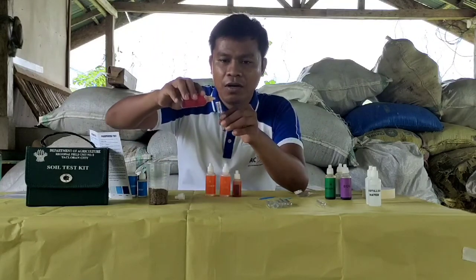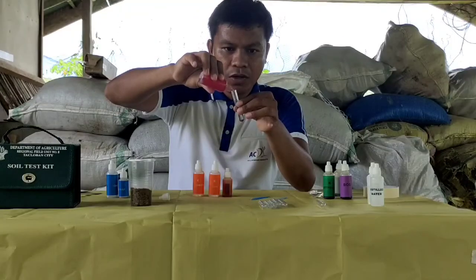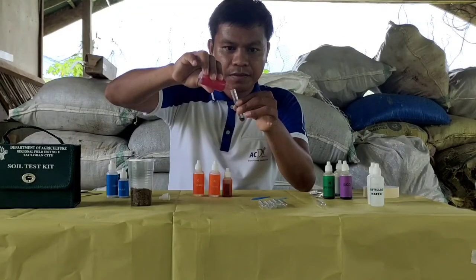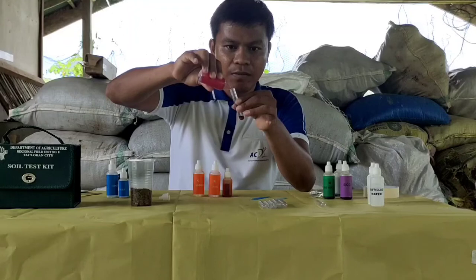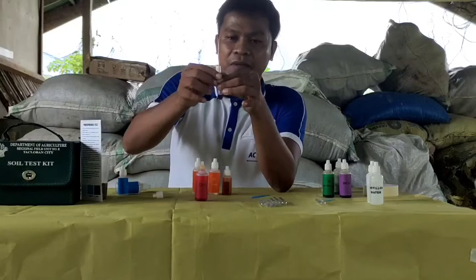Lalagyan natin ng 12 drops — 1, 2, 3, 5, 6, 7, 8, 9, 10, 11, 12. We mix it gently by swirling it 20 times.